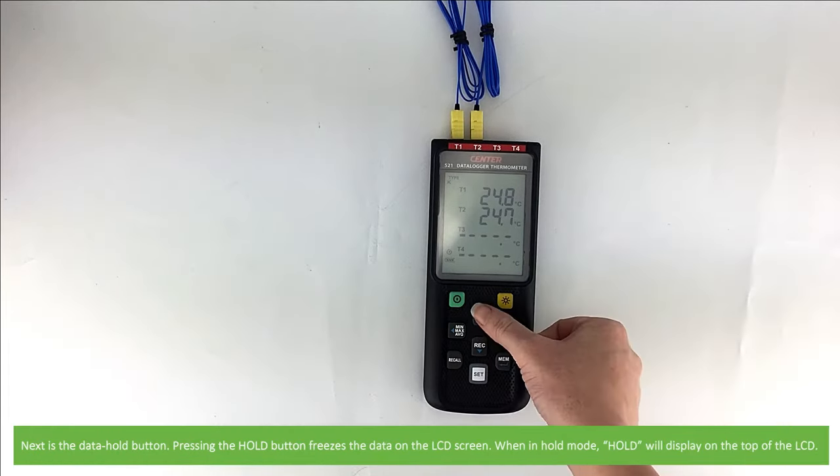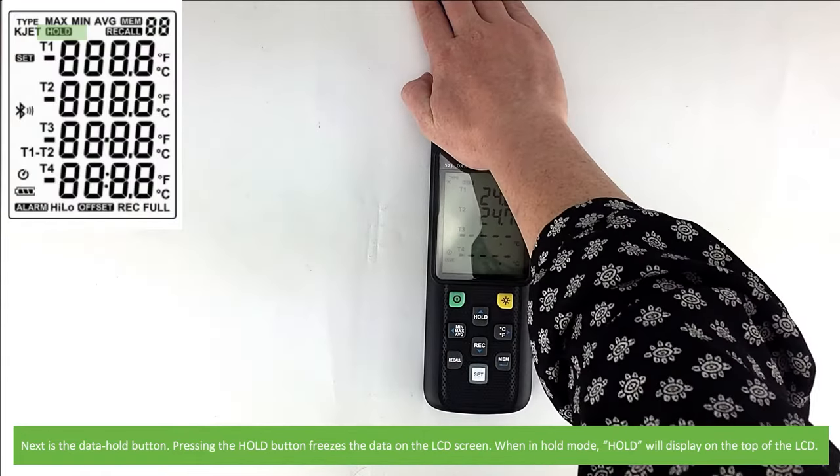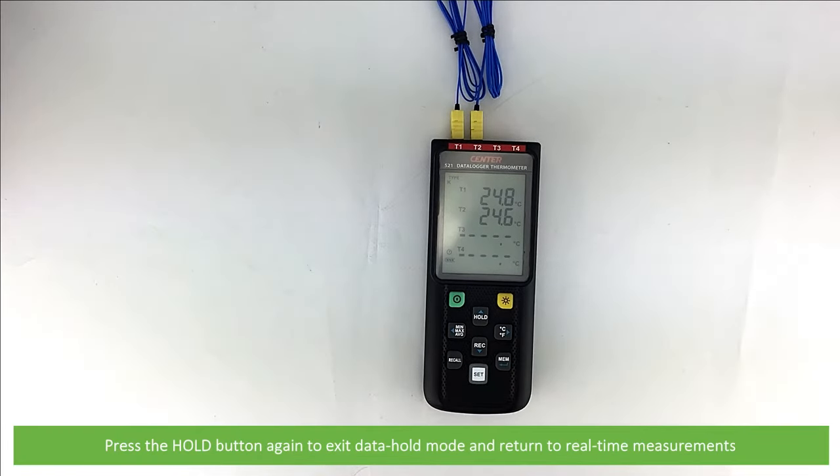Next is the data hold button. Pressing the hold button freezes the data on the LCD. When in hold mode, hold will display on the top of the LCD. Press the hold button again to exit data hold mode and return to real-time measurements.